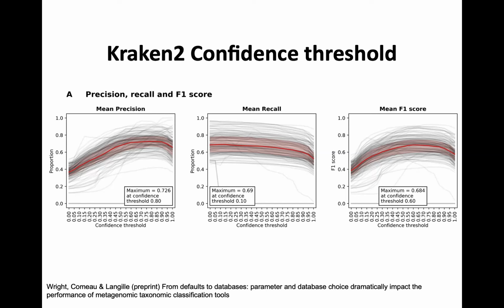And that just means that we can take the biggest database we have, and you would still go into the environment, and the markers are based on trying to find them all for this organism to say it's there. And it can't do it because for this organism we don't have any real close relatives. Whereas Kraken says, okay, I have some similarity here, so I can maybe do a bit better job. It's also because MetaPhlAn, as we'll see, tends to value precision over recall.